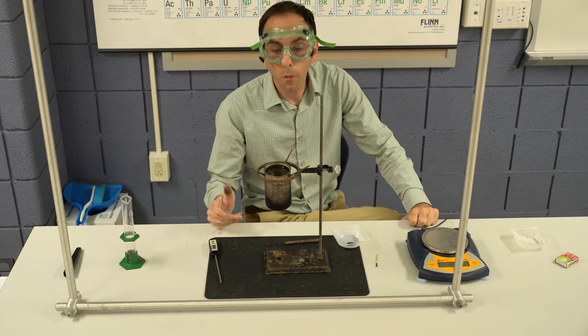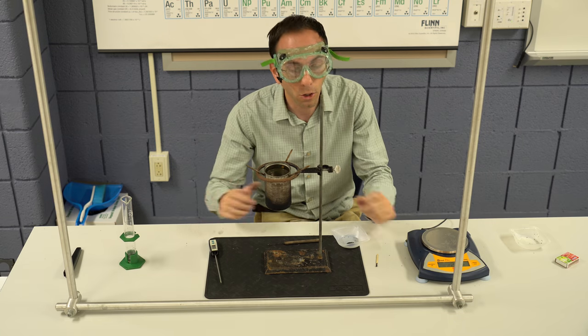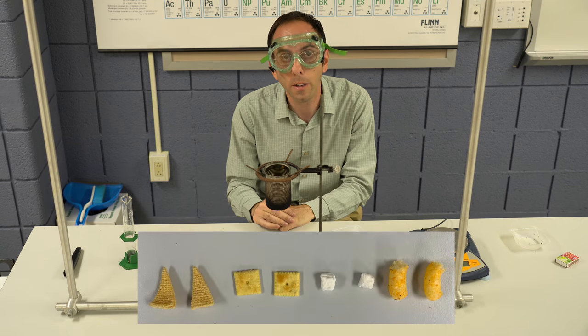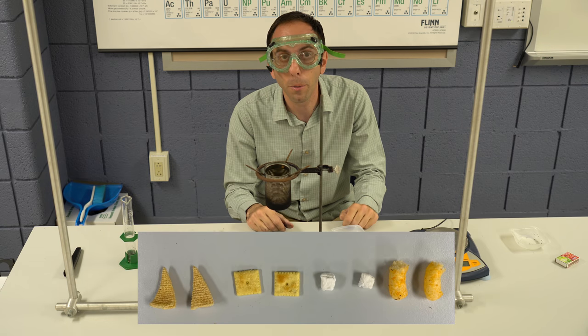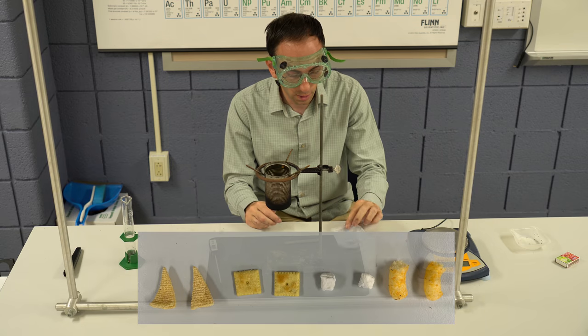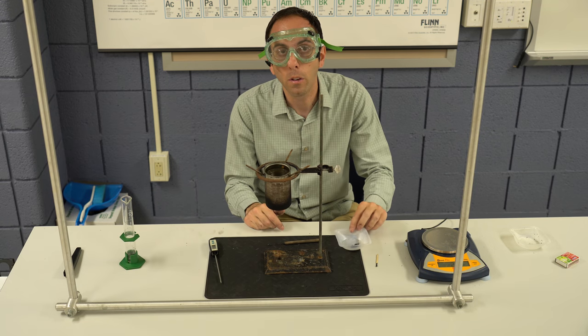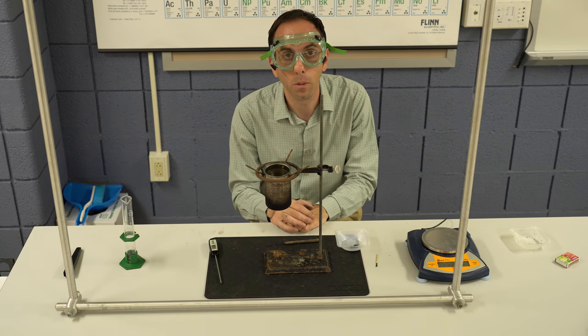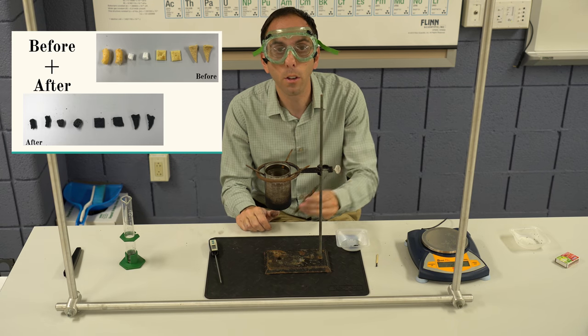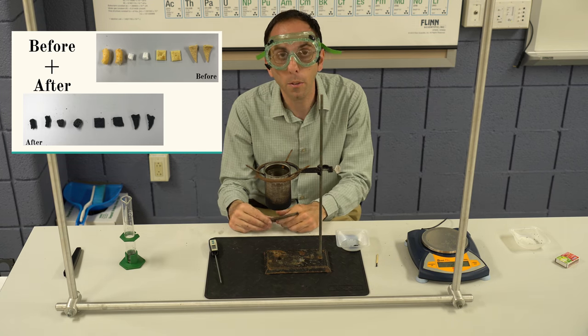So hopefully this gives you a little bit of a basic idea of how to run the calorimetry lab and looking at burning food and being able to now take this data that we've collected with the temperature change of the water and to be able to go through some math calculations to determine how much energy was in various food items. Now you can repeat this with many different food items. You're not just limited to what I've shown you here. The wood skewer is a good idea to be able to support it safely.